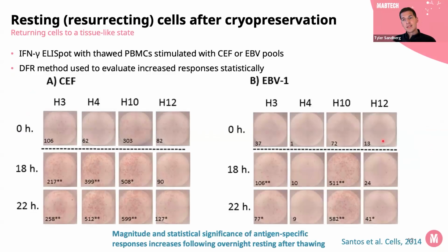And there was quite an elegant study published in 2014 that really showed the benefits of adding this overnight resting, or what we call resurrecting your cells after cryopreservation. So in this study, they used cryopreserved cells and they tested them in ELISpot 0 hours after thawing, 18 hours after thawing, or 22 hours after thawing.